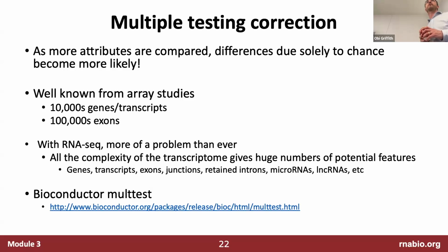It extracts the raw counts columns, yeah. Estimated counts and then TPM counts. Okay, so it sounds pretty similar to the output you will get. Sorry, what was that last thing? Kallisto and Salmon. Yeah, yeah.